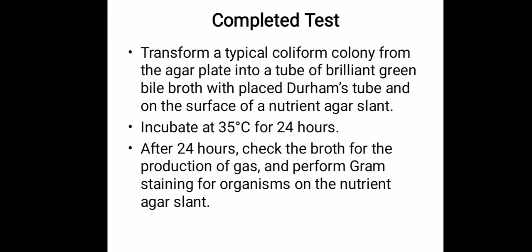If your result is negative, you will see absence of growth and gas formation in the broth and absence of gram-negative non-spore-forming rods when we perform the gram staining.